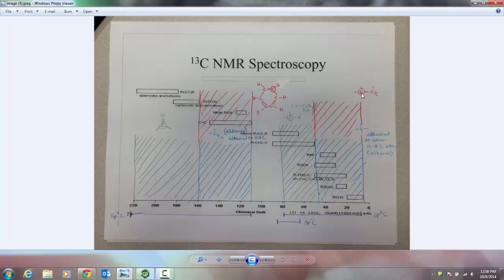If the sp3 hybridized carbon is adjacent to an sp2 hybridized carbon, it happens to fall in the exact same region. You really can't distinguish them in carbon NMR, though they do tend to be a little bit more to the left here, a little bit further downfield, but not always. And then just beyond that, from about mid-40s to about 80 is where you find your sp3 hybridized carbons attached to an electronegative atom, typically oxygen. The others are usually a little bit more in this area, but oxygen does tend to go a little further downfield. But that's where we find our sp3 hybridized carbons.